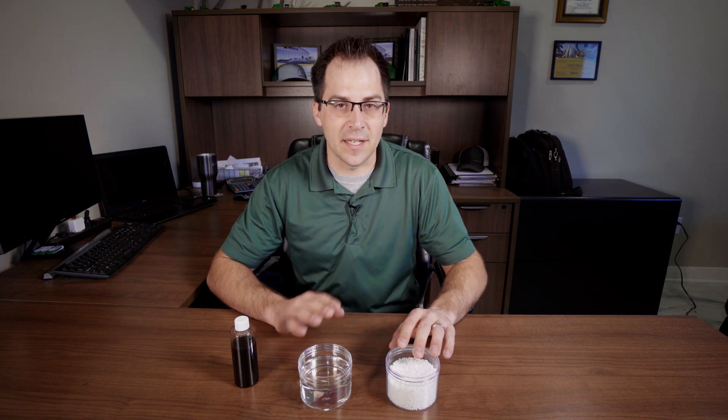It is a nitrogen additive product that can be added to either UAN or impregnated onto urea. Today I want to show you something that we do in our labs this time of year, and that's jar testing.